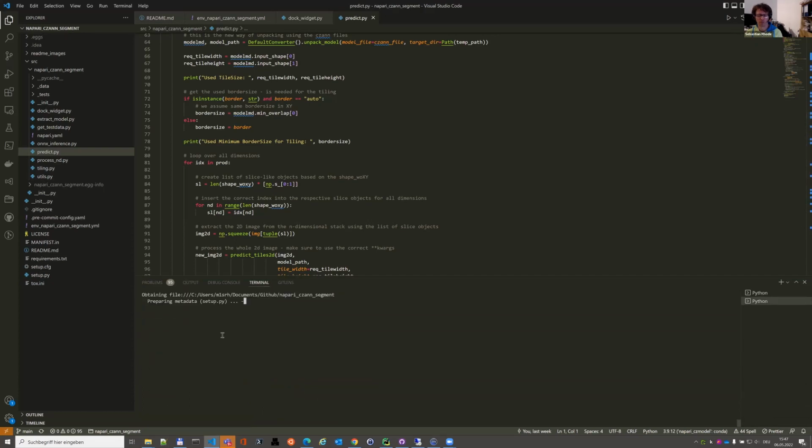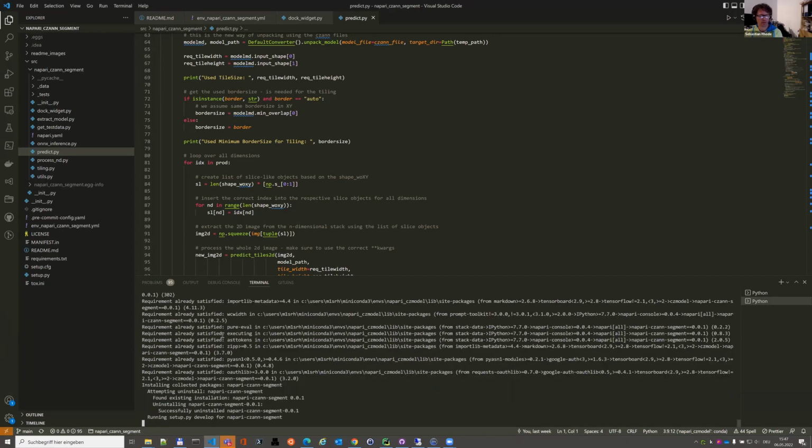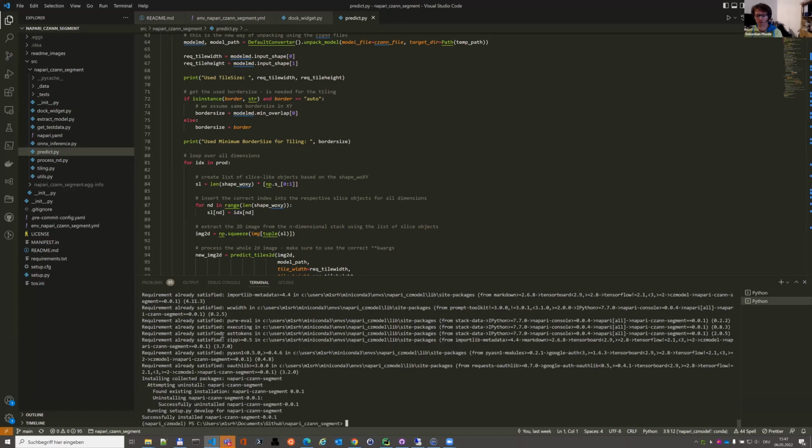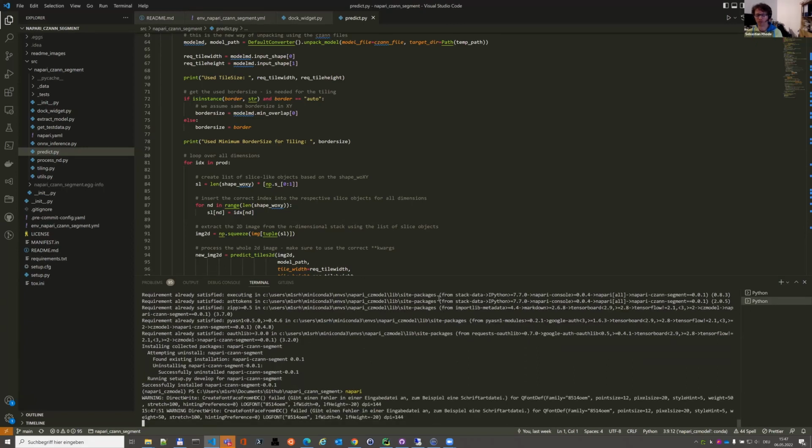It's not on the plugin hub yet. I was not brave enough to publish it, I admit, because I didn't trust my own coding skills yet. But we might do so. If you tell me you like it, we can surely talk about it. Maybe then I will publish it, and not as an official Zeiss thing.